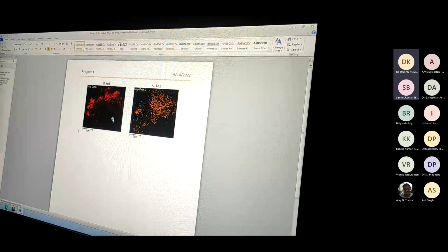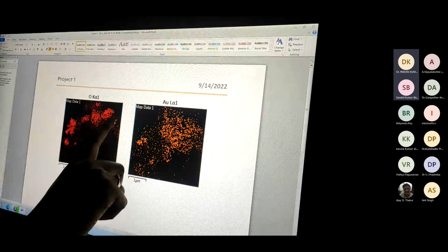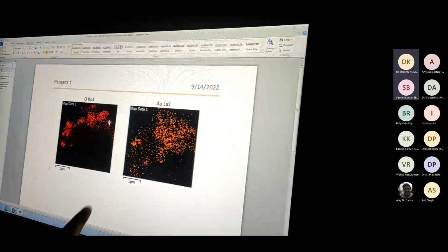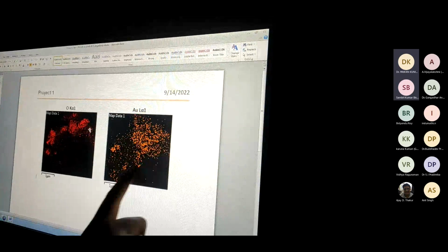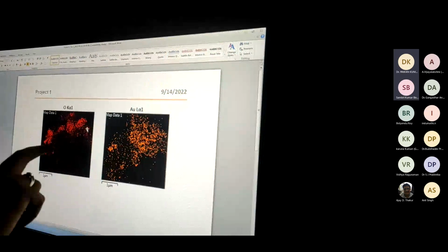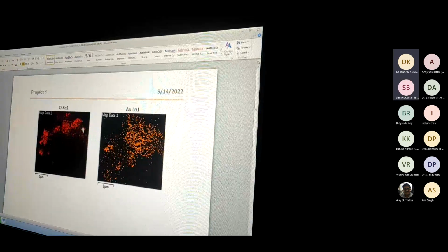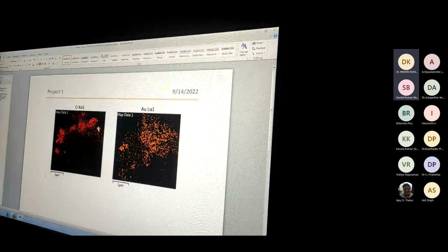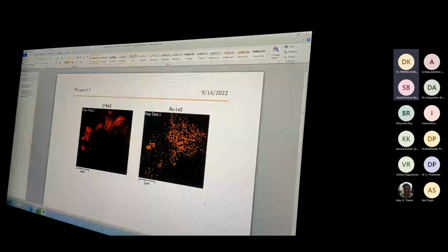Yes, you can see individually. This is for the red, how the oxygen is distributed, and here how the gold is distributed. This is an image of the sample actually, and the gold and the oxygen, how their atoms are distributed. So this is the EDX analysis actually to ensure which elements are present in the sample.